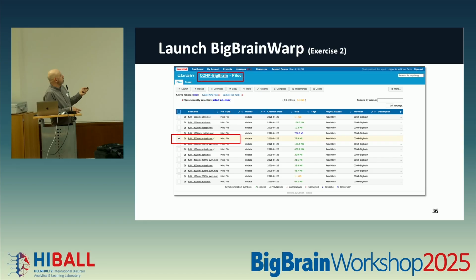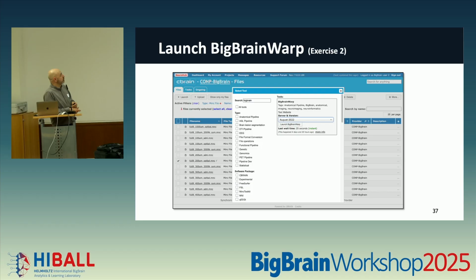And then you're going to do, I'm just skipping over the parts that I highlighted about the one that you select. You're going to select launch at the top left. Okay, so that's going to then bring you to the menu where you then have your tool control.